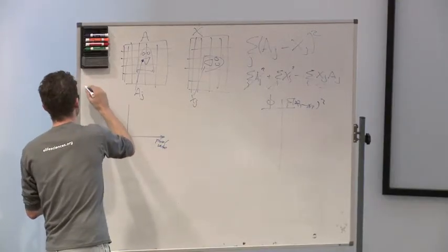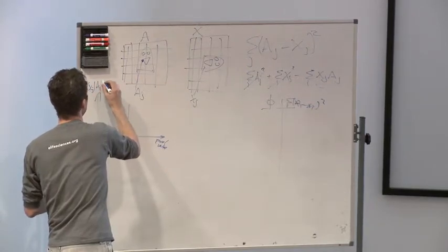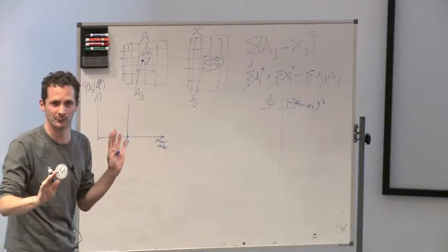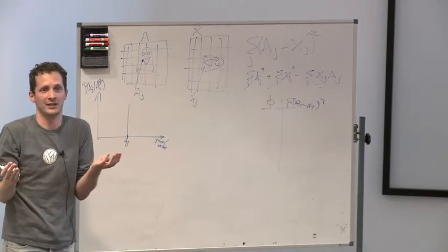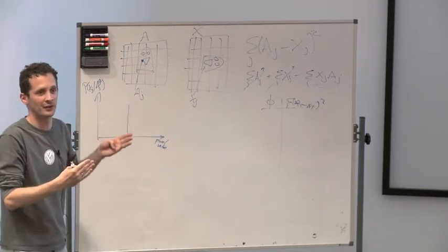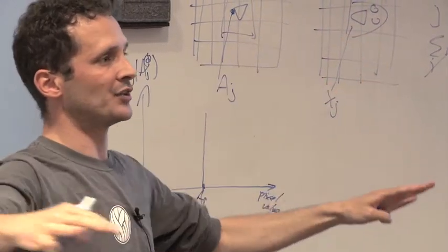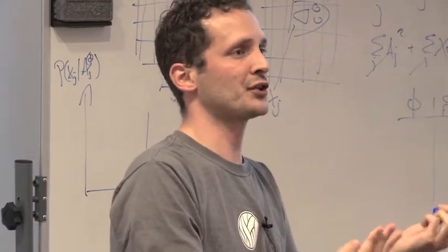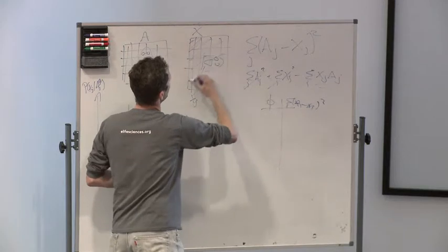So if I calculate the probability of observing a pixel value x given image aj, which implies some rotation, which is wrong now, okay? But we don't care about that for now. The most likely one will be pixel value aj, because we assume this is the true picture. And then how much does the probability decrease as we go away from this pixel value? Well, that depends on how much noise is there on this picture, because this is an experimental picture.